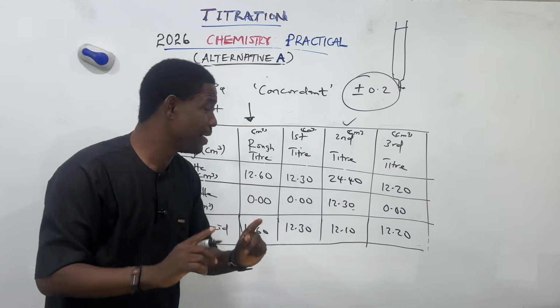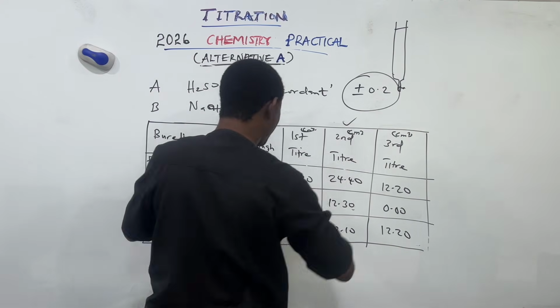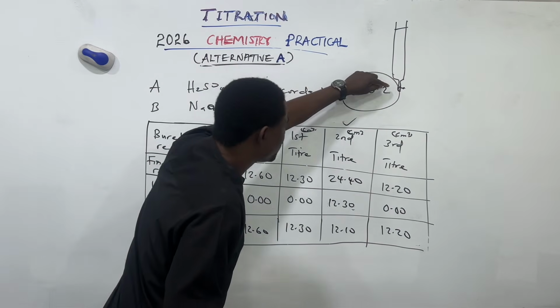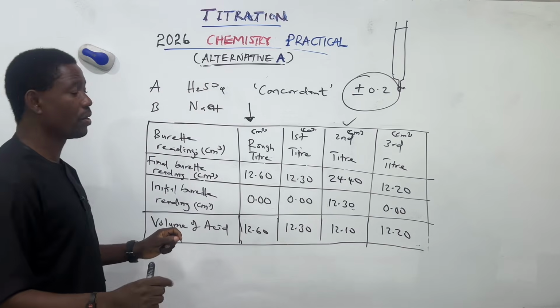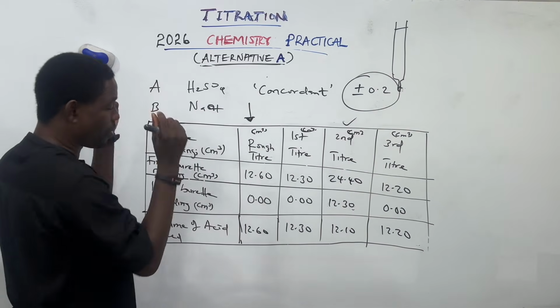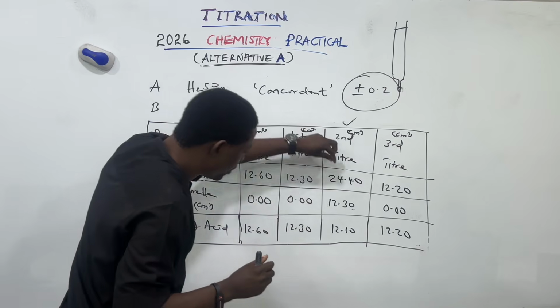You know why I say it's a very sensitive technique. Very, very sensitive. And you must get something very great. Once you get to 10, you go to 11, drop by drop. There will be the last drop that will change the color permanently. That is why it is important for you to know where your rough is. So the rough will guide you where the color is going to change, so you pay attention around that time.